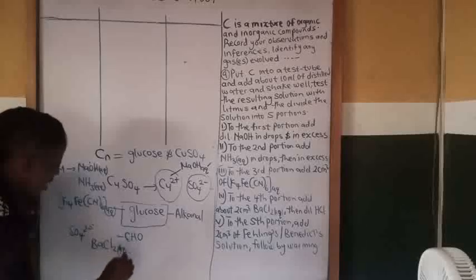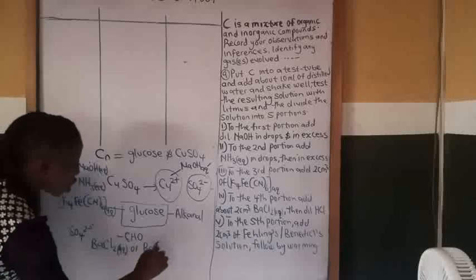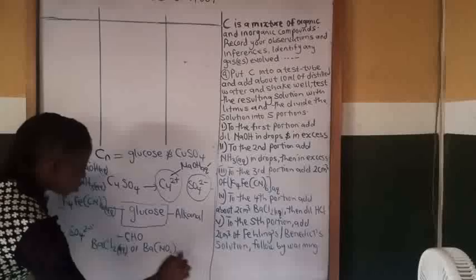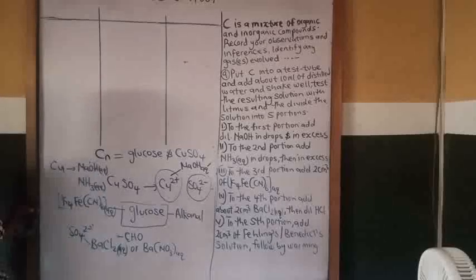Aqueous barium chloride, or aqueous barium nitrate, to test for the anion.